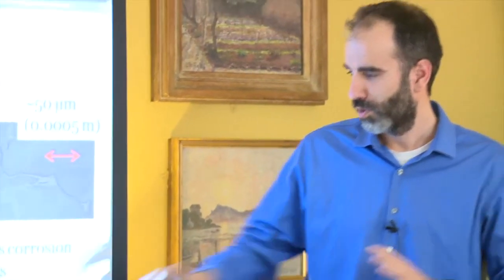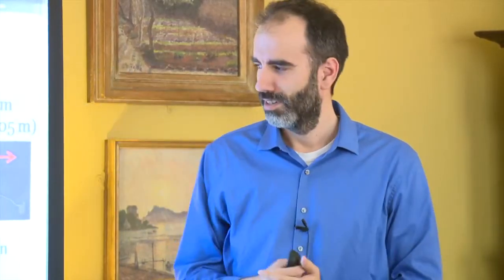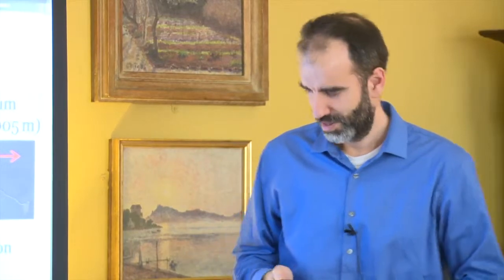So to put this in context, 20 million times with an electron microscope, while with an optical microscope you cannot go above 2,000. That's where the two start making a difference. So that's a bit of a trip from big macro scale things to very small atomic scale things. These are our tools.